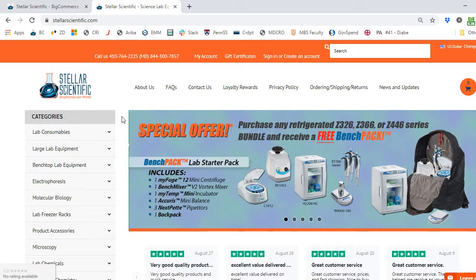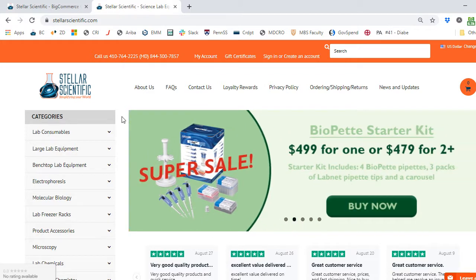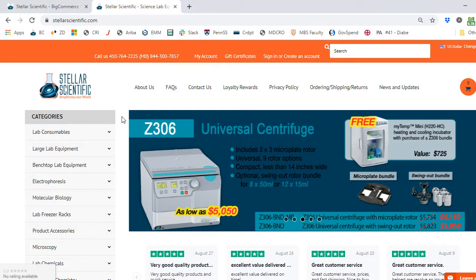In this short video, I'm going to show you how easy it is to use the Stellar Scientific website to select a Hermle Universal Centrifuge. If you know pretty much what you're looking for already, we've got a great simple category called Hermle Centrifuge Bundles. Let me show you how to navigate there.